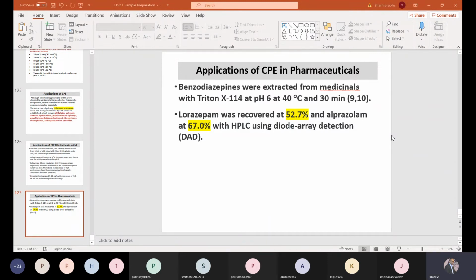I have listed 5-7 extraction procedures. There are 3-4 more advanced ones which I have not taken in your syllabus because I don't want to overload you with different techniques. And that is all which you will find in literature as of now, 2021, in any field. There are 3-4 more which I have not included in the syllabus, which are slightly more advanced, for semester 3 and 4.